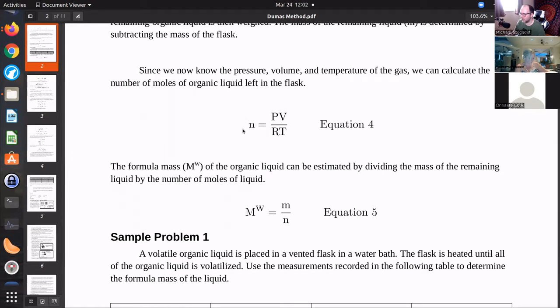And basically the number of moles of this gas, if it is ideal, and this is a pretty good situation where it's going to behave like it's ideal, even though it's not, because you're going to have low pressure and high temperature, which is what leads to this being valid. At low temperatures and high pressures, it won't be.